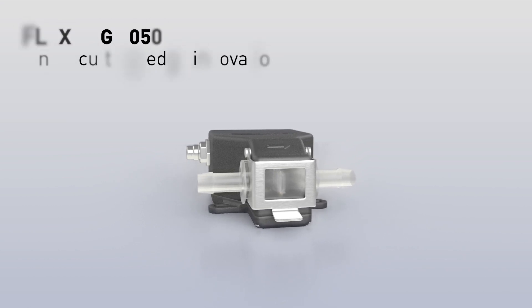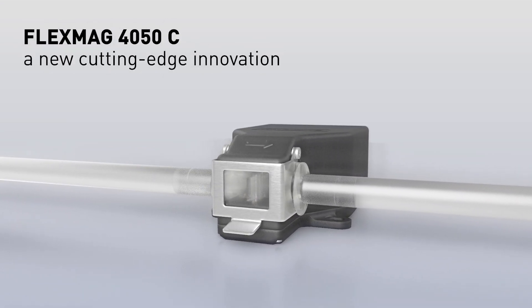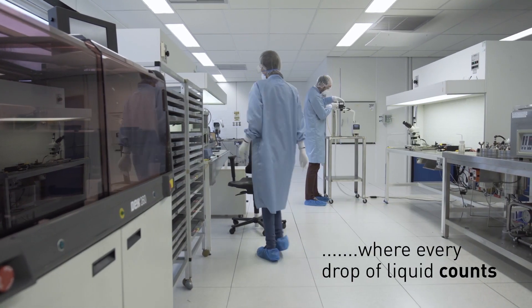Krona has developed a new cutting-edge innovation in the world of electromagnetic flow meters. With the FlexMag, Krona enters the biopharma market where every drop of liquid counts.